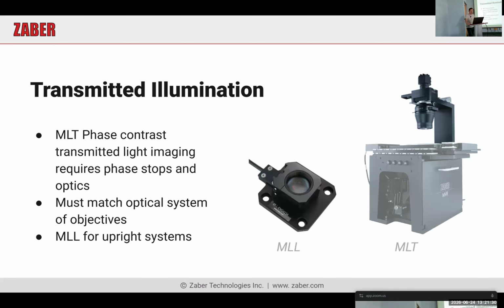And we have transmitted illumination. Again, very straightforward. We're just shining a light through the sample. For materials, often not as relevant because oftentimes your samples are going to be opaque. Although if you wanted to see through, like a semicon wafer, we could put long wavelength NIR or shortwave infrared LEDs in there, and that will go through a silicon wafer.